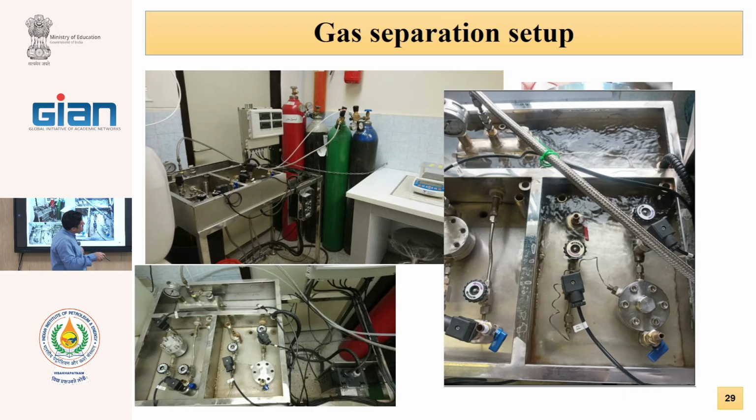Also, as you see, in this setup we have a left system and a right system. You see better. This is the permeation measurement. This is for measurement of the solution coefficient, adsorption coefficient. In the previous lecture, I said that in gas separation, solubility and diffusivity are important for measuring how much this polymer likes to adsorb these gases.